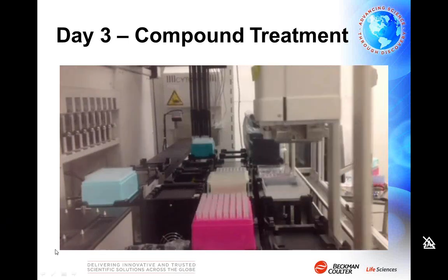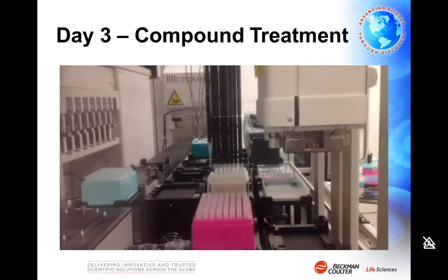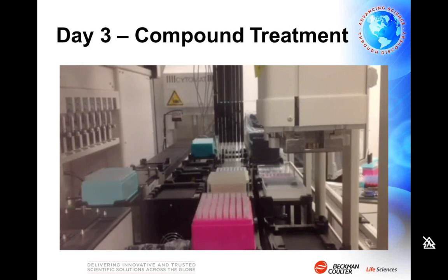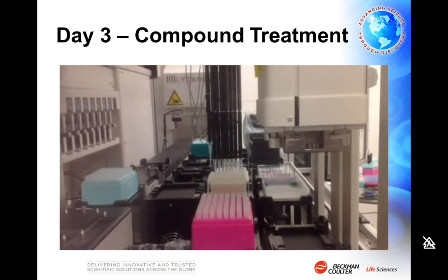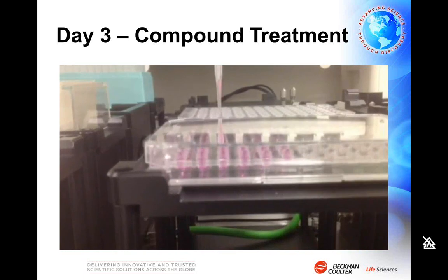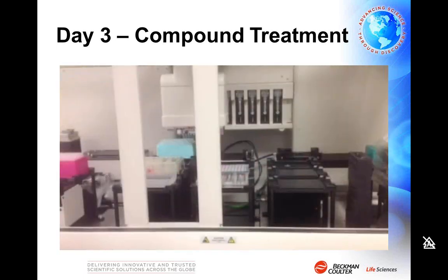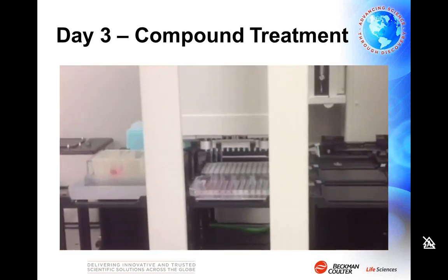In the background, you can see our span 8 pipettors that I mentioned earlier, accessing the reservoir that has DMSO containing media for our dilution curves of the compounds, and dispensing it into the 7 wells that do not already contain compound. Same thing, shown from the front, again accessing the bottom 7 rows of our compound plate. Then for the next step, we use the enhanced selective tip to pick up the 3 tips we needed to do a row-wise dilution curve.